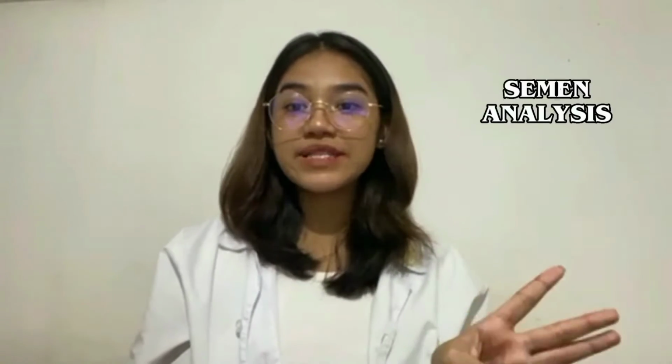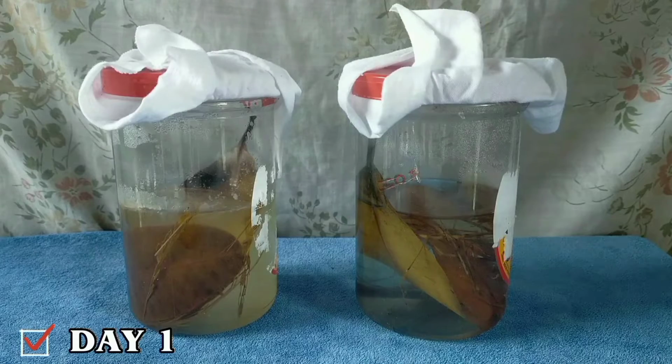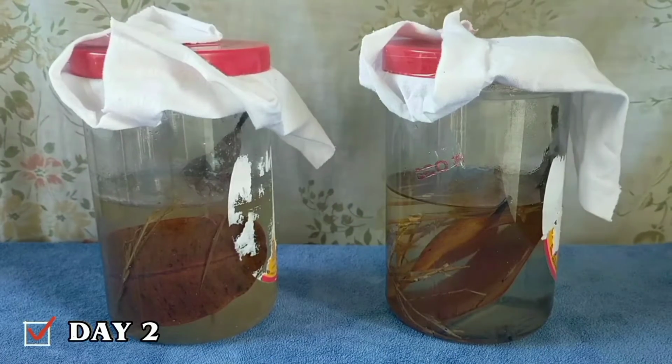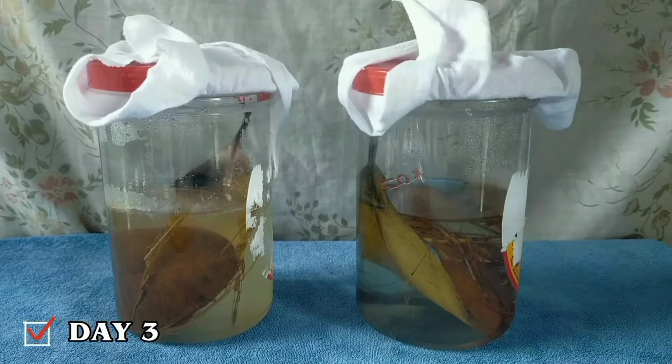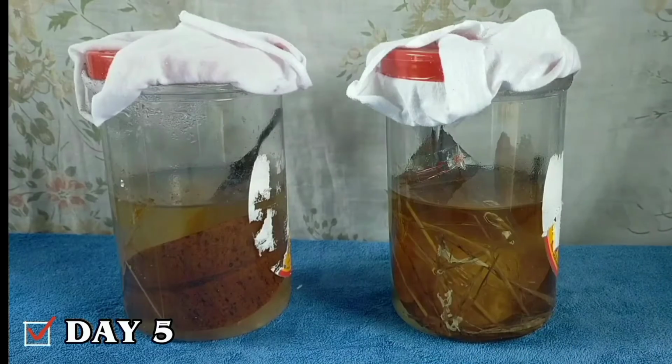Various activities including hay infusion, onion peel cell, plant cell, and semen analysis are covered in this video for the day. So without further ado, let's watch the video where you will learn and observe how those processes are done. In this part, you may observe the transition in the series of hay infusion within 2 weeks, from the start of the 2-week period to the end.